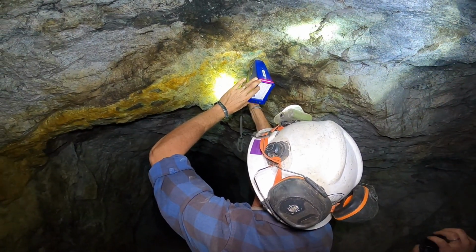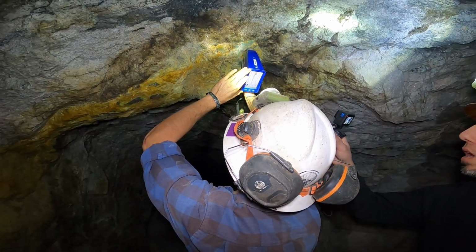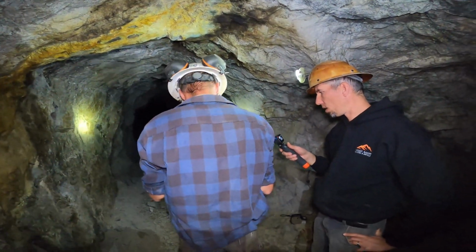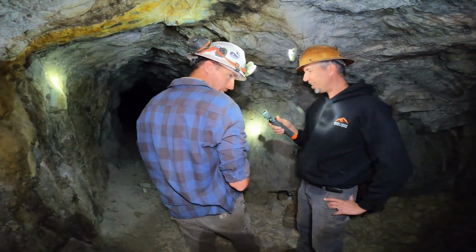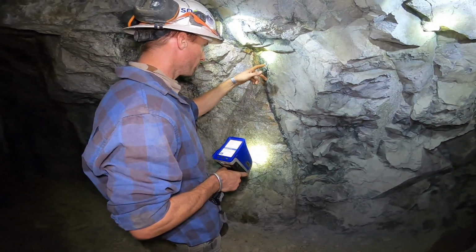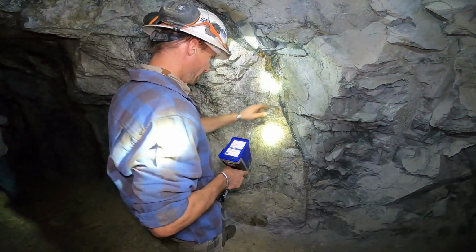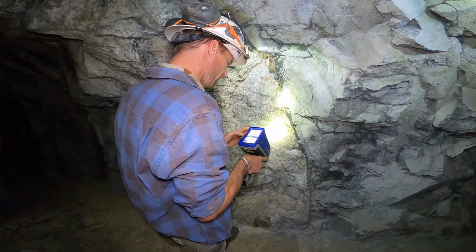We're getting a little bit of cerium and lanthanum. I'm never gonna get that one right. All right, it's done. Okay, what do we got? You know, I think we might be able to discover a new element. And now I'm pretty sure that's calcium. Before I'd be like, I have no idea what it is, it could be any salt. But you scan enough, you start to see, okay, I know there's a chance it's that mineral. So you don't have to guess as much.